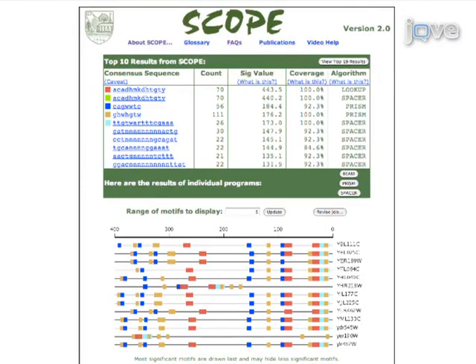These patterns serve to confirm the original motif identification and to suggest extra genes that might be considered for further biological investigation for co-regulation with the original genes submitted to SCOPE.